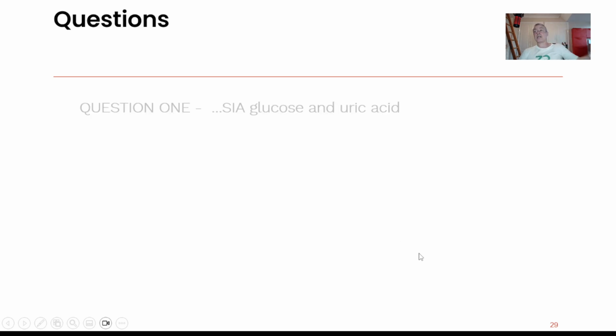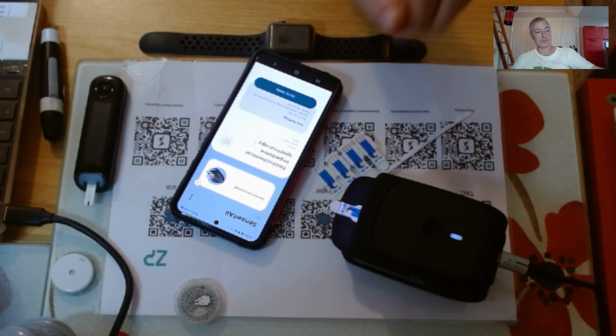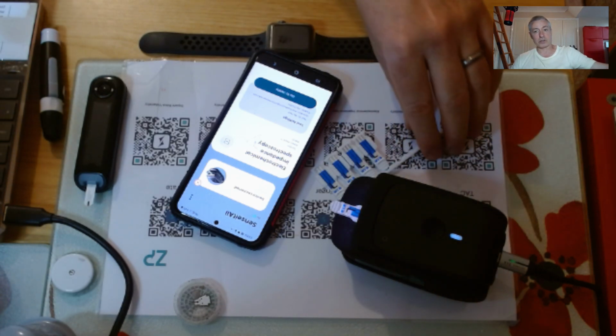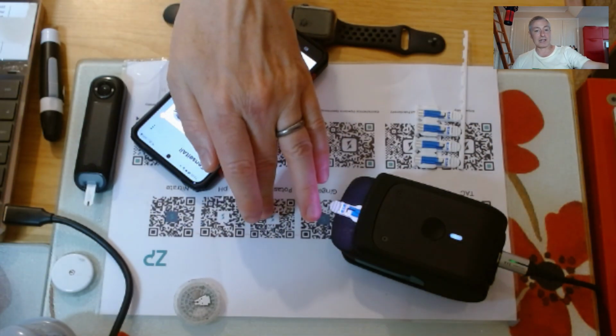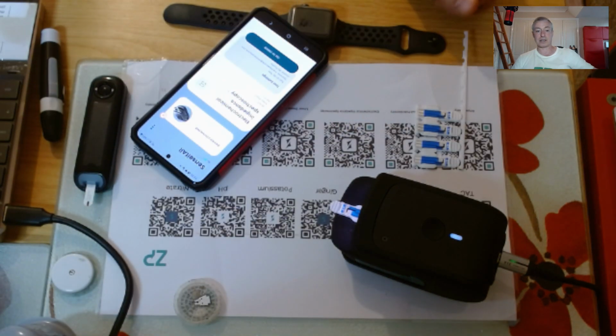So let me just do a quick summary. To lift a paper that's really at technology readiness level number 3 to something that's higher is a lot of investment and a lot of time, and it will take probably more than 3 years most of the time. And most of the time people's PhDs or postdocs are over. So you have to jump on a platform that's already quite mature. I'm obviously biased, but we've got the SenseIt platform that can be used both for analytes and for fundamental electrochemistry.